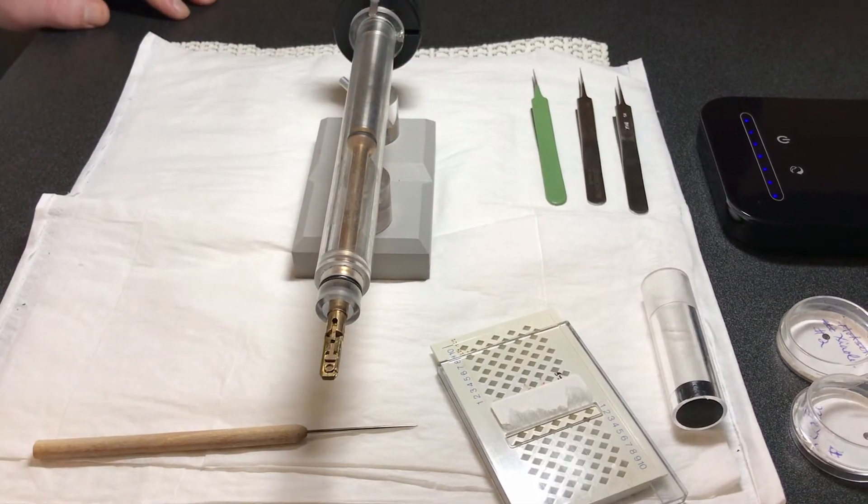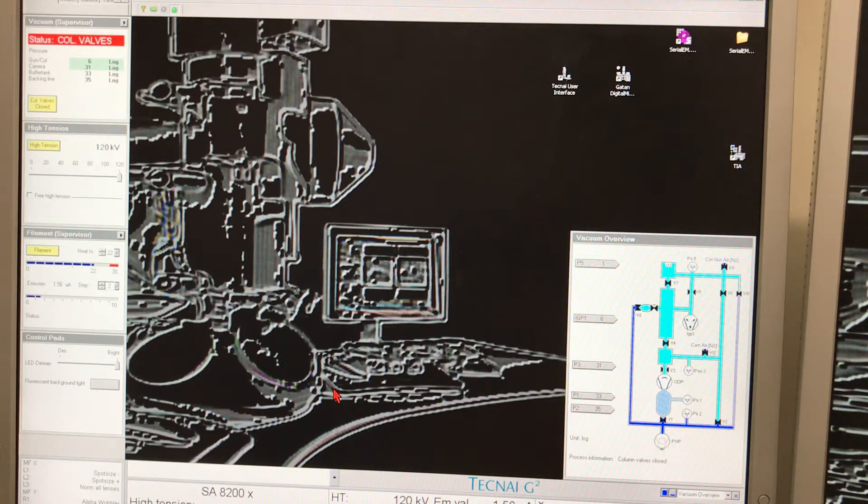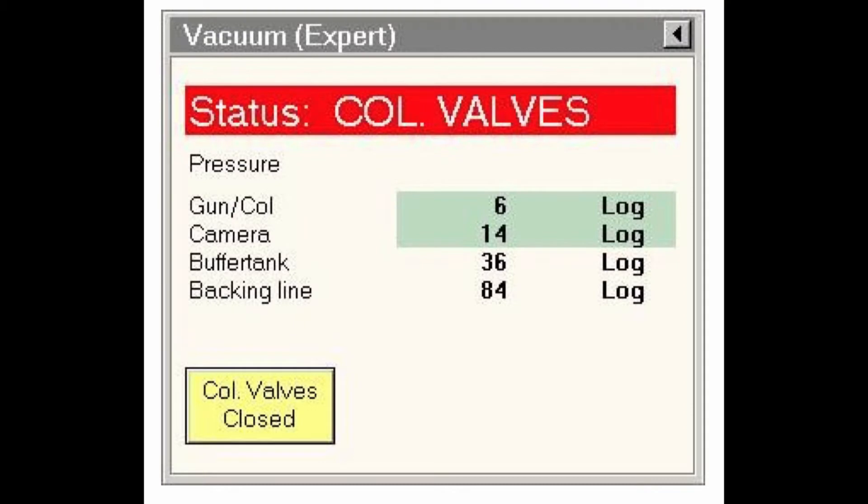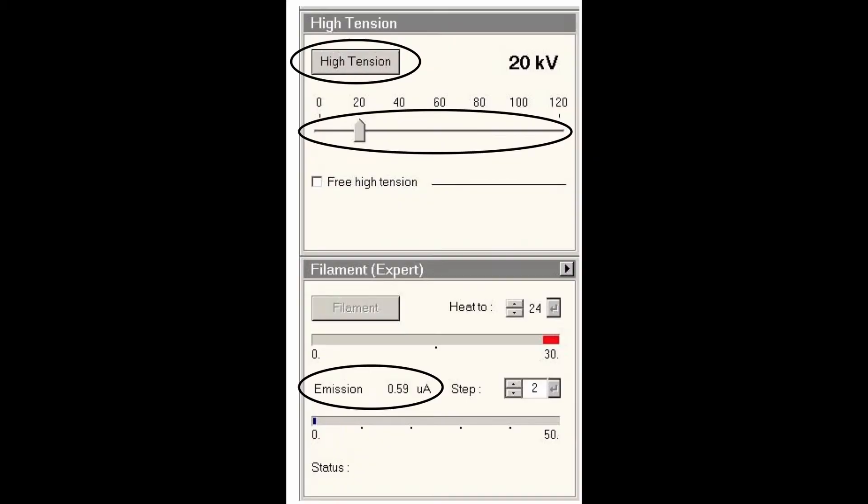At this point we've checked that everything on the microscope is working okay and we're ready to load our grid for imaging. First, we need to look at the TecNai user interface, which has many controls for the microscope. The status column box on the left side tells you how the vacuum at each stage in the microscope—gun, column, camera, etc.—are doing. If any of those first two values are not in green, the microscope is not okay for operation.